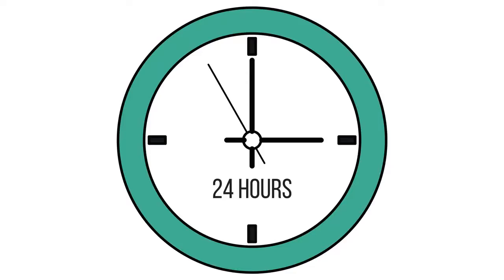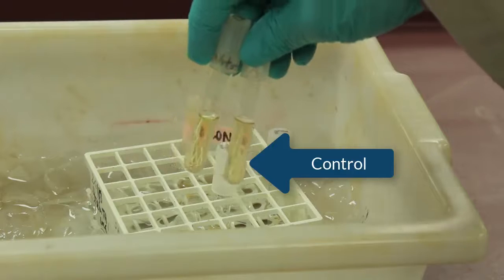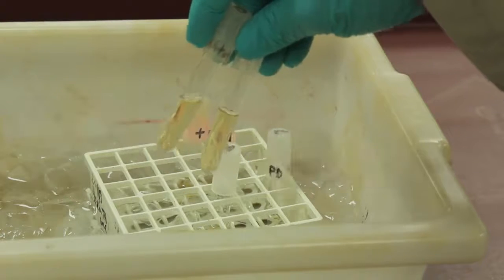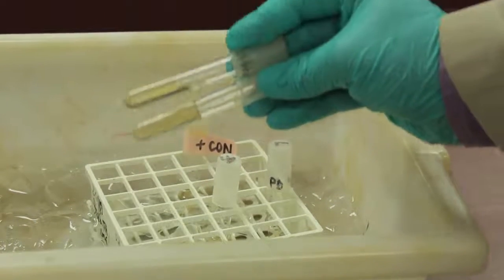After 24 hours incubation, you could see something that looks like this. Notice my control tube is on the right and my test tube on the left. Notice now how the gelatin has become liquefied.